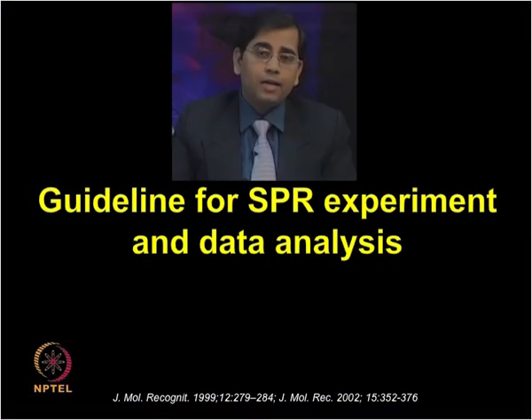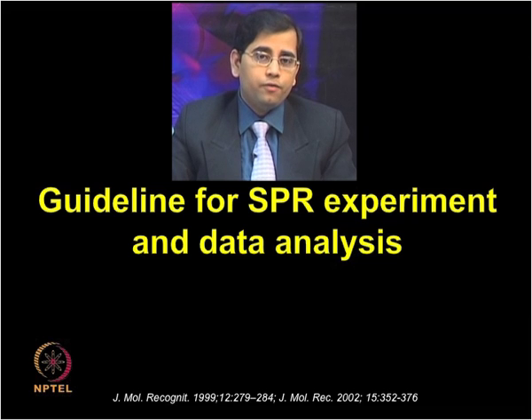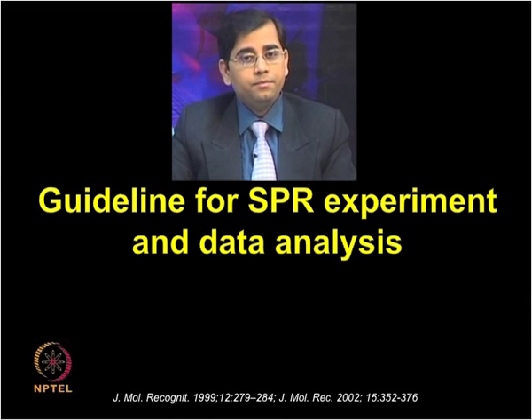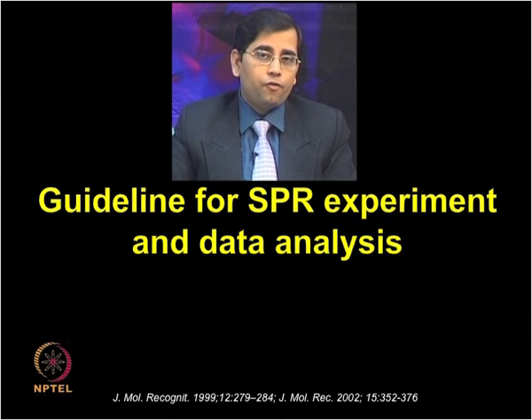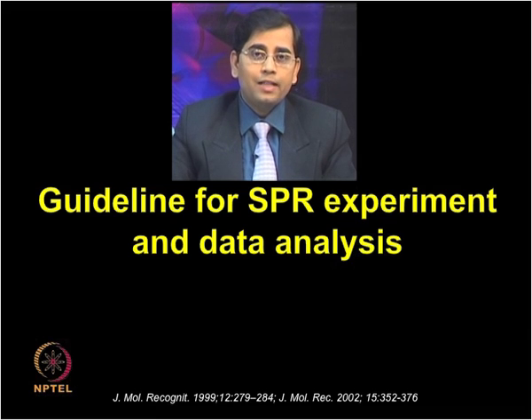Performing a good SPR experiment and accurate interpretation of binding reactions from these biosensors are always very challenging. David Myszka from University of Utah in USA has provided very detailed guidelines, as shown in some of these references for biosensor analysis.